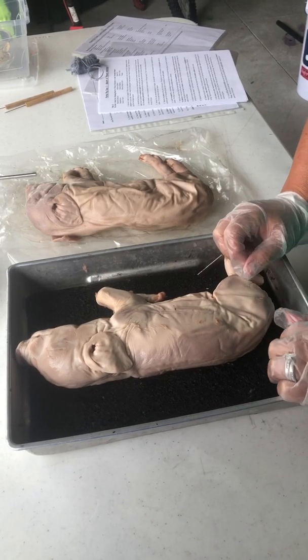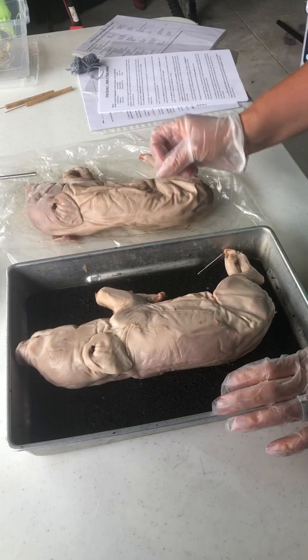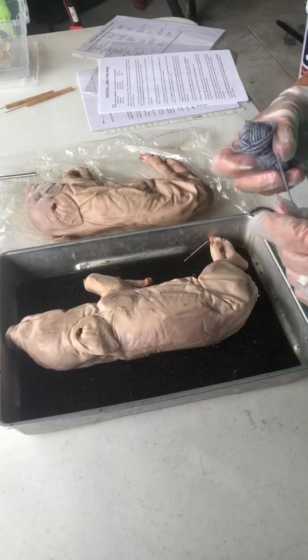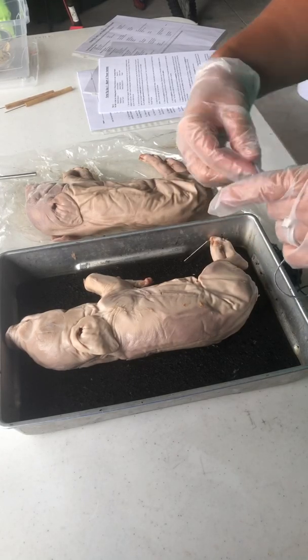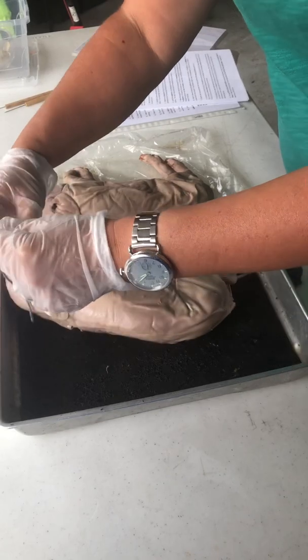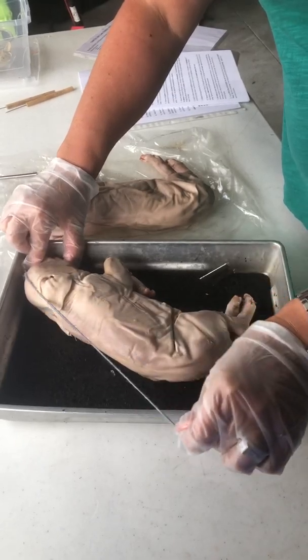The second step is the fetal pig has not been born yet, and its approximate age since conception can be estimated by measuring its length. So you're going to measure the length of the fetal pig from the tip of the snout all the way to the base of the tail. We're going to do that with a string. So here I'm going to take the string and I'm going to go from the tip of the snout all the way to the base of the tail, which is right here.